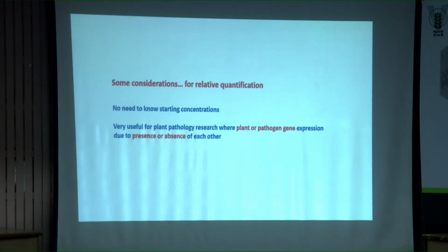And some considerations for relative quantitation. No need to know the starting concentration. Very useful for plant pathology research, where plant or pathogen gene expression due to presence or absence of each other can be studied, right?